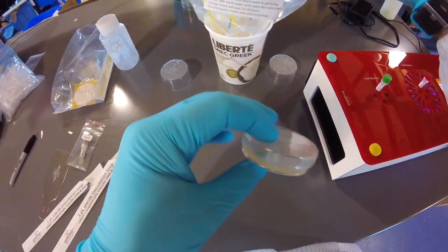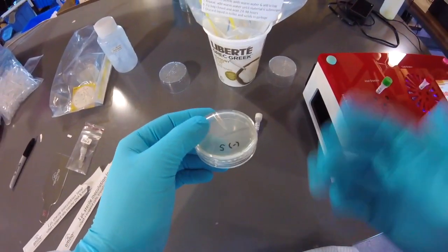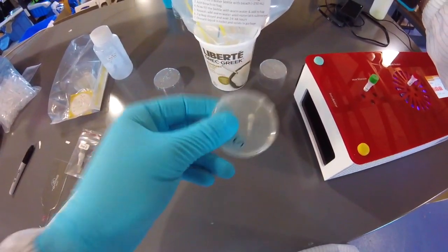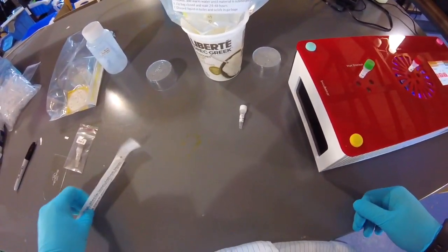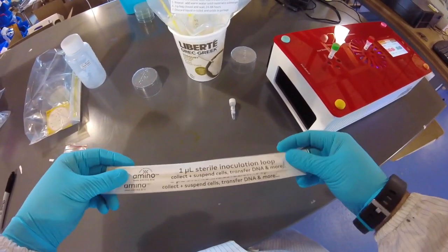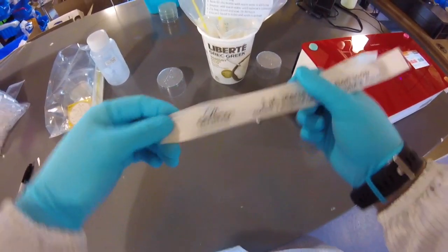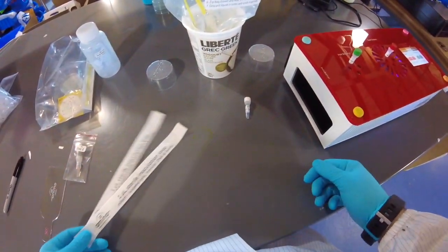You can log them in your logbook, or take pictures every step of the way so that you can log your journey and keep it sort of as a journal as well. So take pictures, but ultimately this plate can go into the bin as well. Just like yesterday, these sterile loop packaging, they can just go into the garbage. They don't need to be put into the inactivation bag because they are sterile. So these can go into the regular garbage.